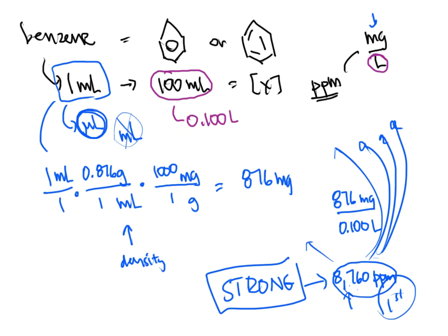So a couple of weird things here. Okay, I'm just going to circle these. Number 1 is going to be the solvent amount. They're typically fairly large, and it's typically not DI water. So we have to be kind of conservative. We have to make sure that we're prepping these the right way before we do them.